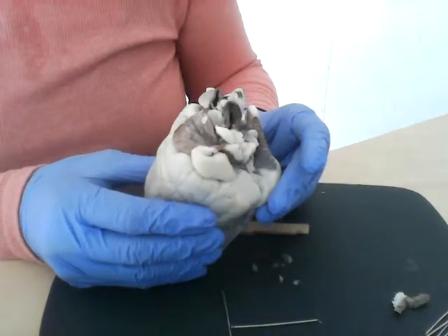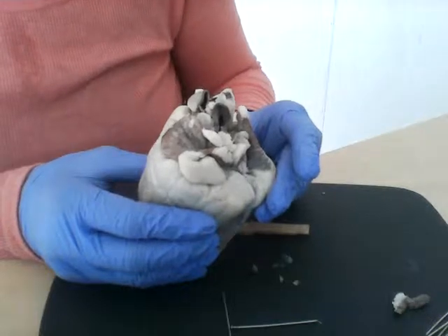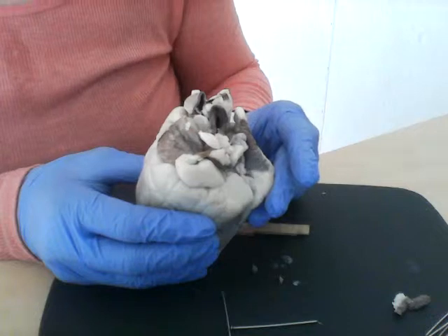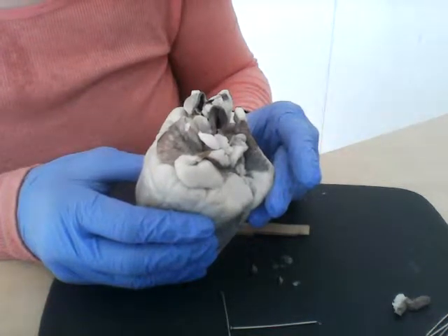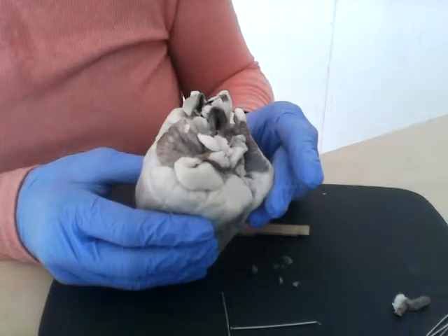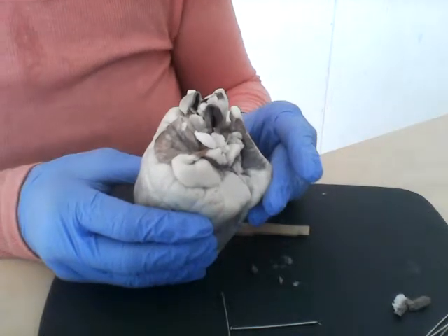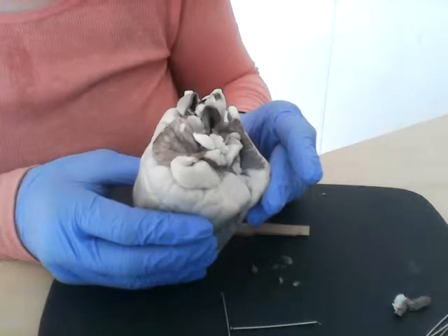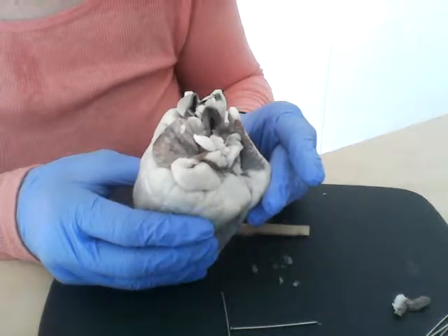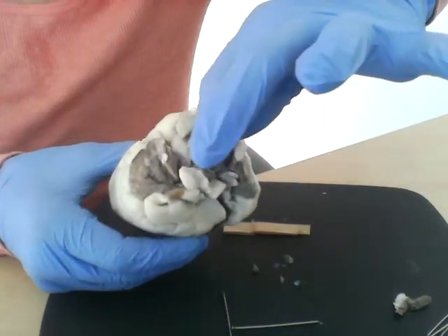And then the aortic arch with the three main vessels, the brachiocephalic artery, and then the left common carotid and the left subclavian, those last two I couldn't locate on this heart, but the brachiocephalic trunk, I believe, is located here.